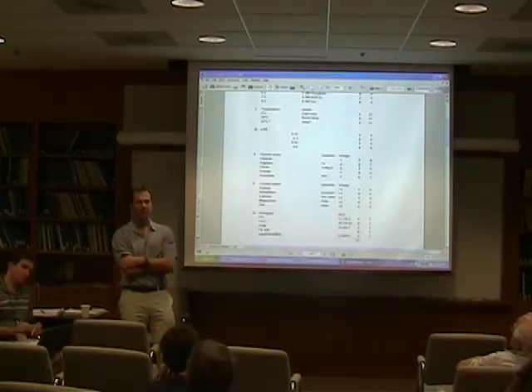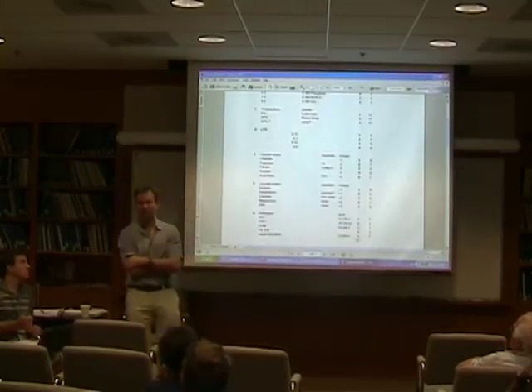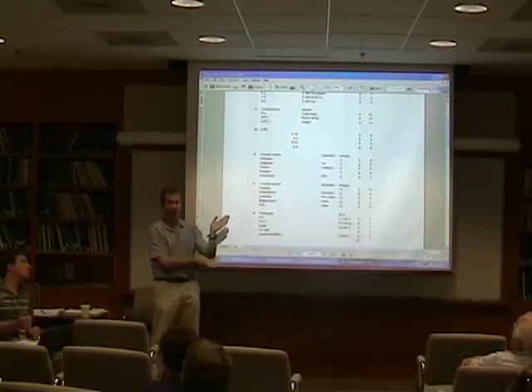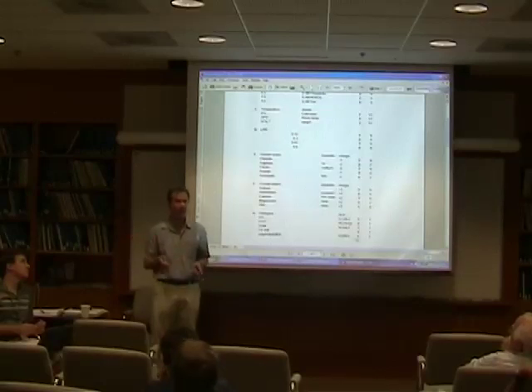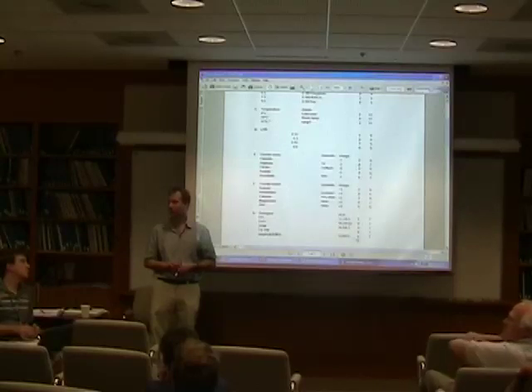So it strikes me that we're going to have different problems for different projects. Some people will have lots of protein, some people won't. And I think the best thing we can do is have as wide a screen as possible, and individuals would then take these factors and choose them on the basis of their particular project. And that way you can say, I can only do 12 screens, you choose the ones you want to choose. And maybe that's the way to go.